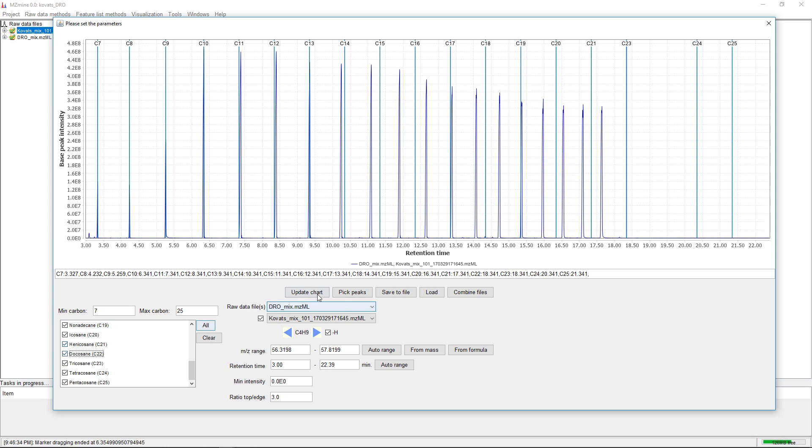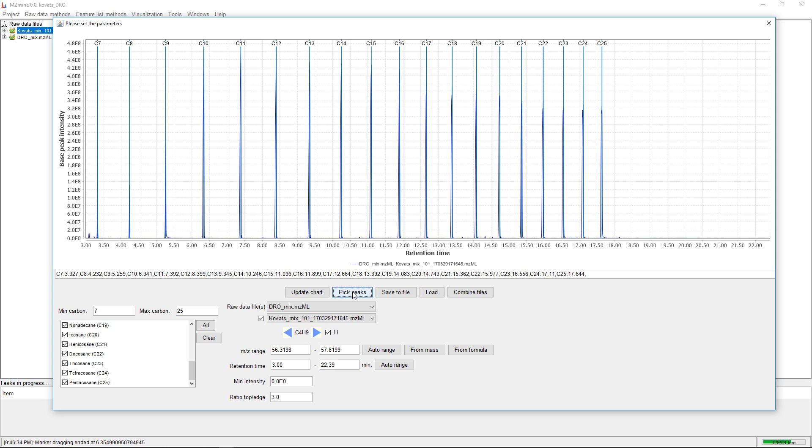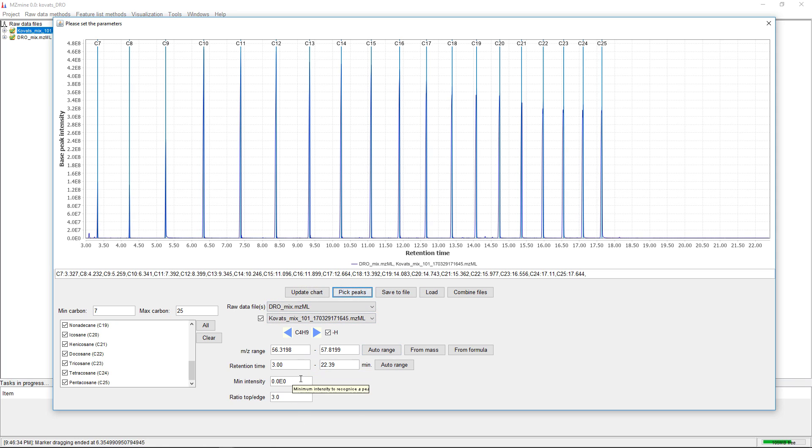Then we just click on pick peaks. With the standard settings and my data set, we can directly pick the peaks without changing anything. Of course, we could adjust the minimum intensity and ratio top to edge.